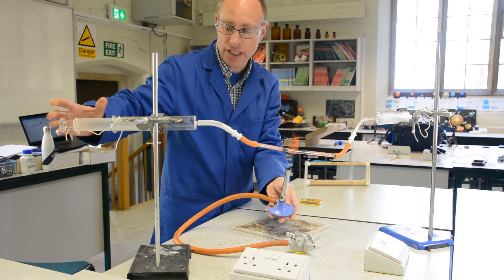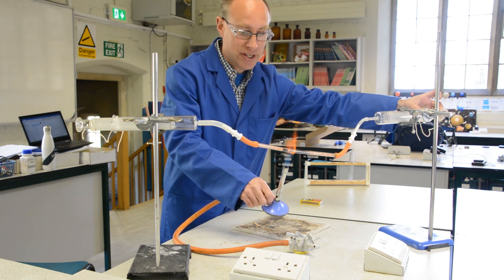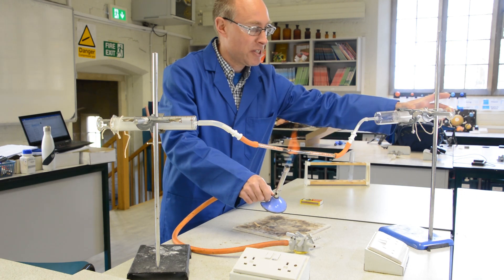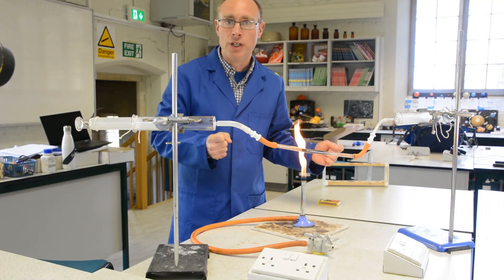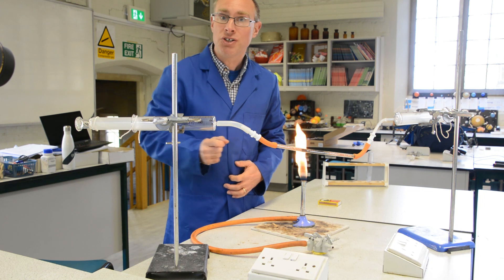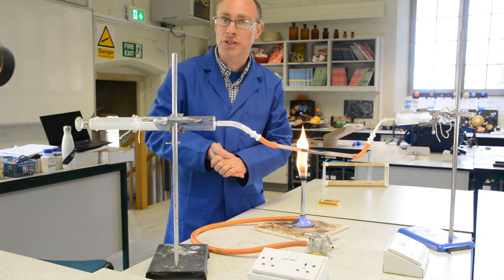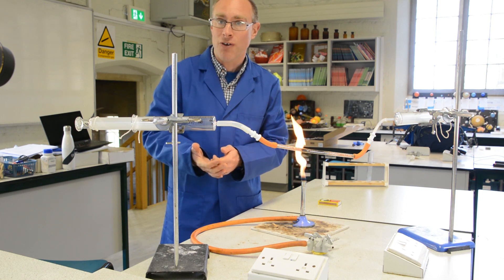And at that point, no matter how many times I pass the air over the copper, the volume of air in the gas syringes won't change. So eventually, after I've been heating it to and fro a number of times, we'll end up with 79 centimetres cubed of air left. We started with 100 centimetres cubed and ended with 79 centimetres cubed, which means we've removed 21 centimetres cubed — and that is all going to be oxygen. Therefore, 21 centimetres cubed out of 100, or 21% of the air, is oxygen.